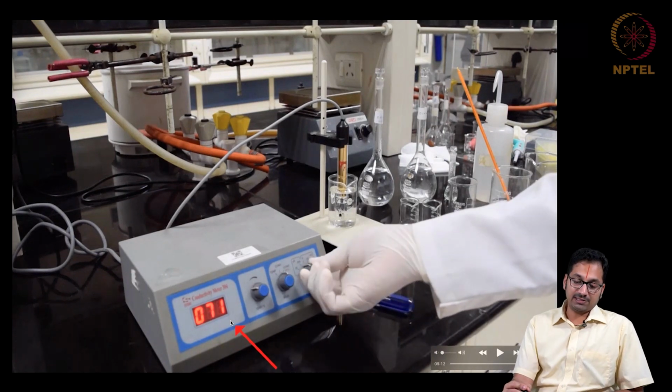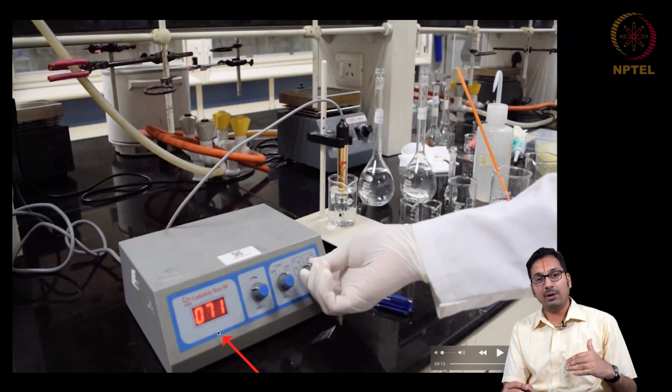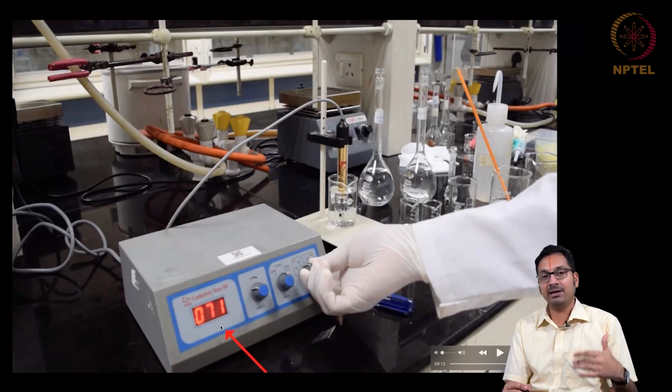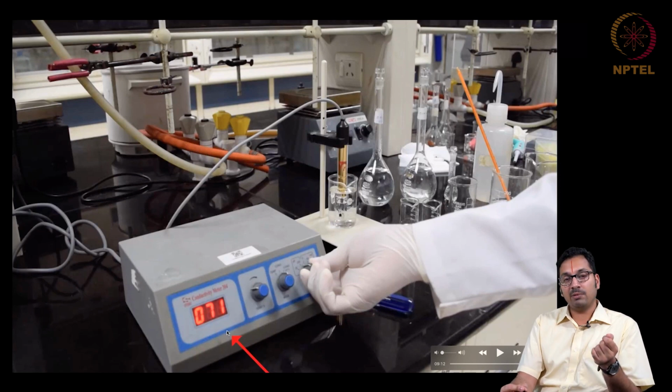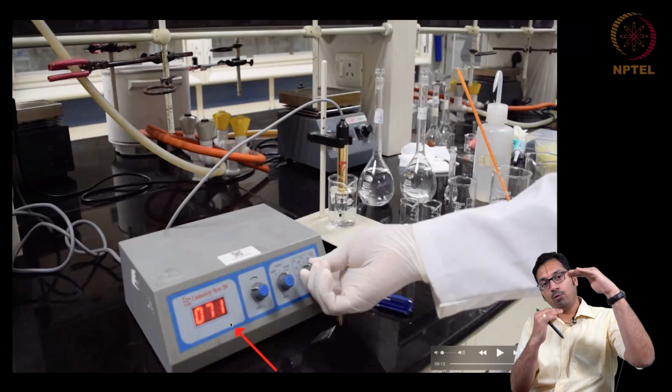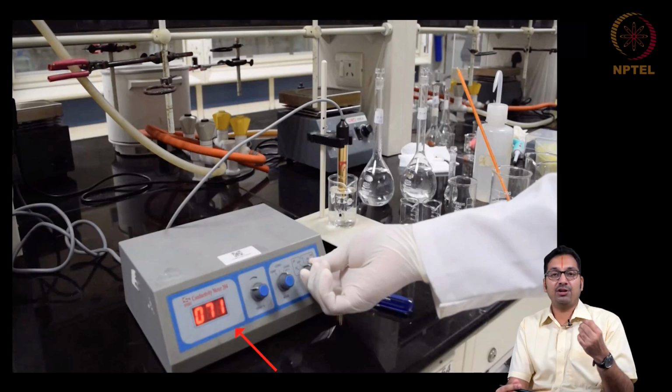So this makes total sense, because if you are having a reading of 71 microsiemens, and you are putting it at 20 microsiemens as the maximum measurement, the conductometer is not able to read. This is a common problem that will come up with different equipment where they have their own range of measurement, and any measurements that you might do higher or lower might not be detectable.